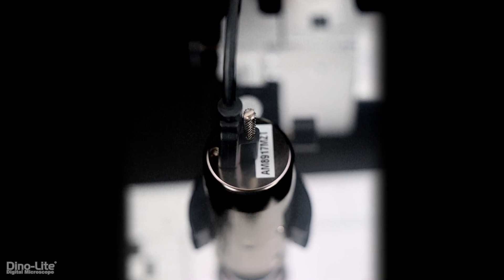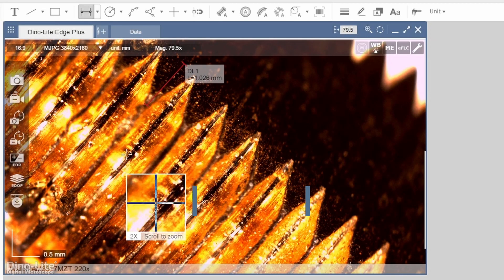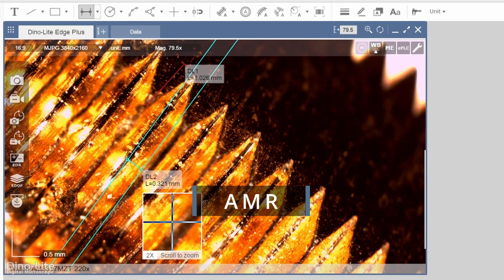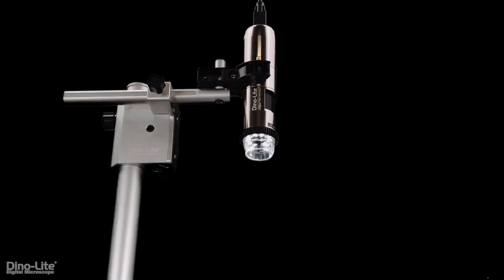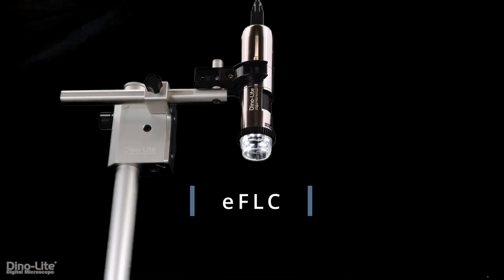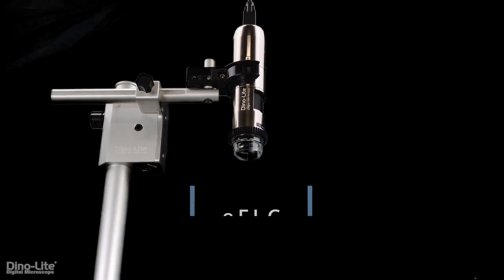Certain models may include other familiar Dynolite features. Automatic Magnification Reading automatically maintains the measurement scale. Enhanced Flexible LED Control provides granular control of the internal LEDs.